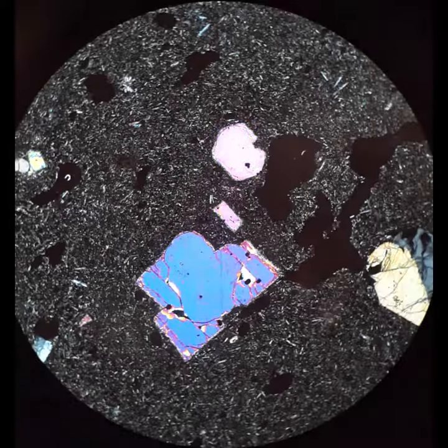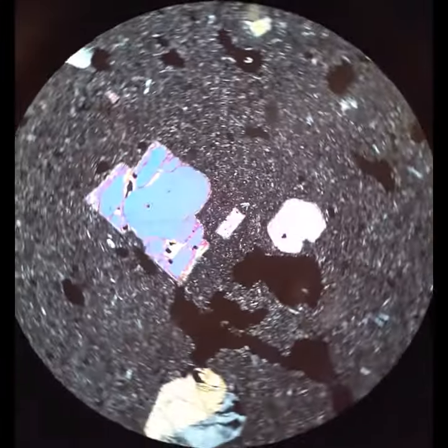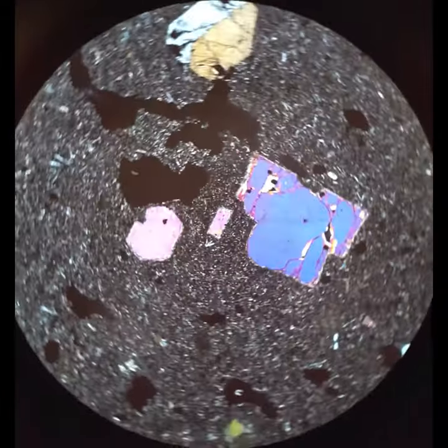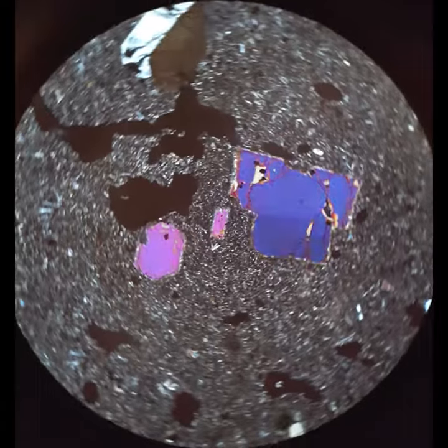This is maybe a good point to say that I'm really terrible at identifying olivine in thin section. The relief is very similar to the pyroxenes. Sometimes it has cleavage. High interference colors and parallel extinction are giveaways.